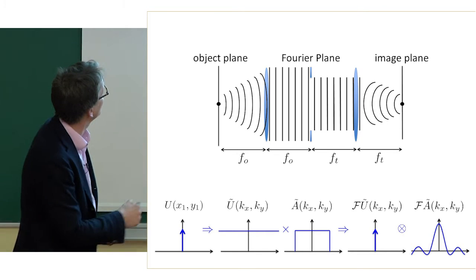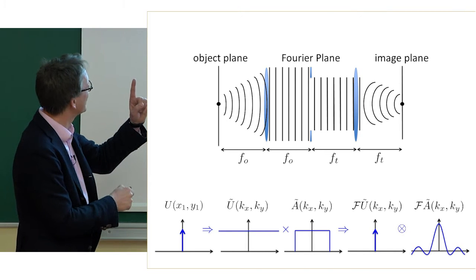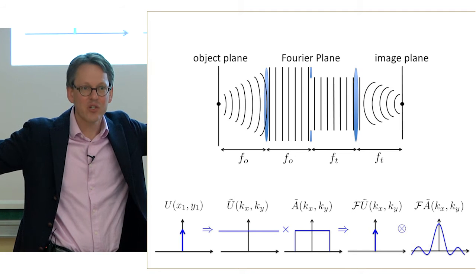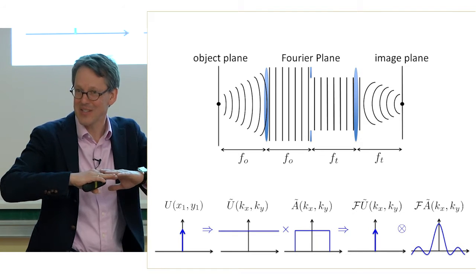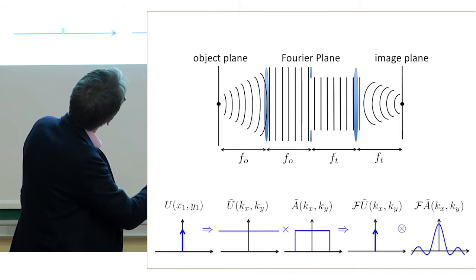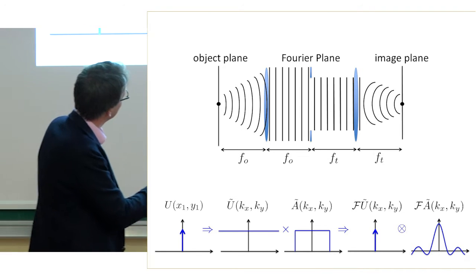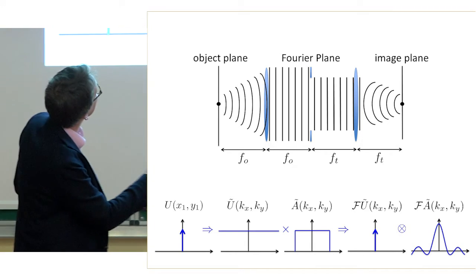And so if I take this point here, I can represent it with a delta function, right? It's just a point object. And you can see that this is a Fourier transform here because here you have a plane wave. It's infinite in all directions. What's the Fourier transformation of a delta function? It has infinite frequencies in it, right? So essentially what you have here is an infinite extent of frequencies in this direction here. So a delta function has a Fourier transformation that's unity over all frequencies. Okay? So here we have that, you see this.